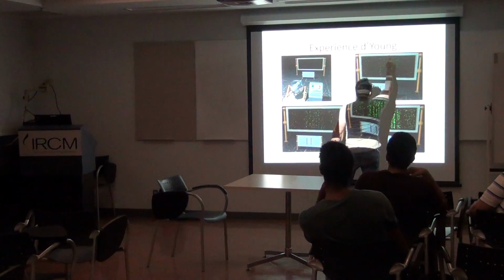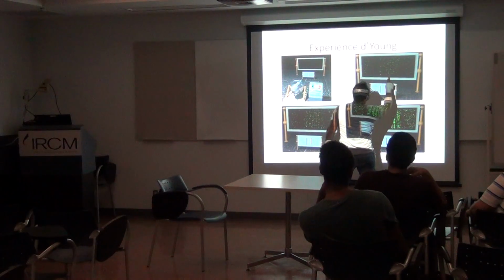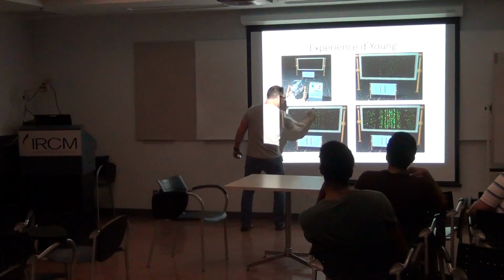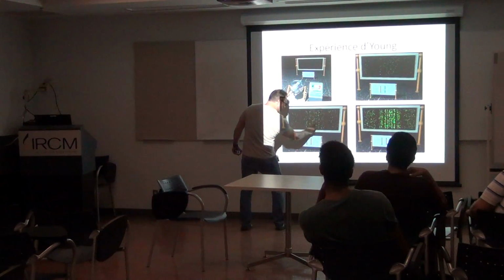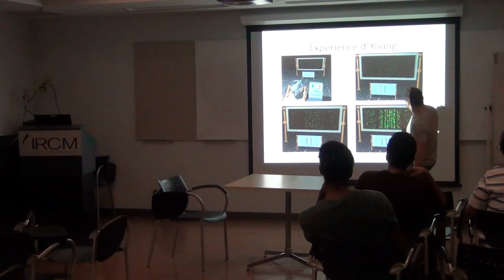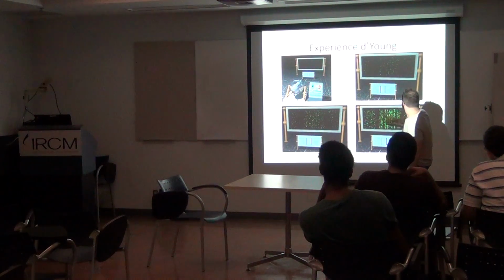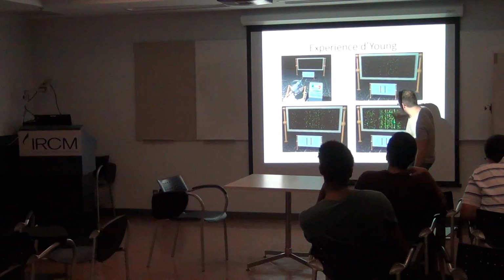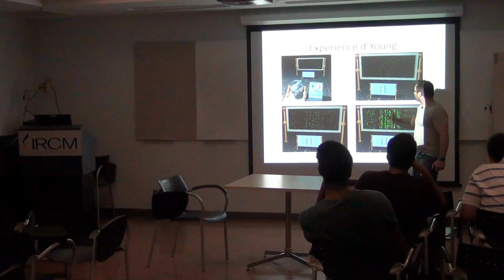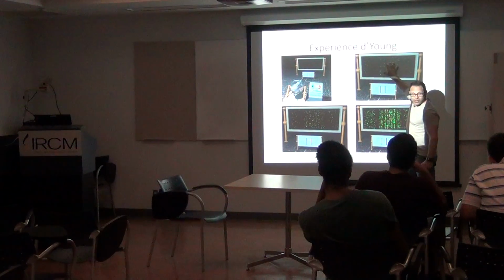So let's say I only have this image here. With this image, I can figure out that the center is about here, maybe. And if I go here, it's much easier to figure out that it's here. And with this one, since there are 1, 2, 3, 4, 5 lines, the center must be somewhere around here. So it's much easier to figure out the actual position if I get much data instead of having this.